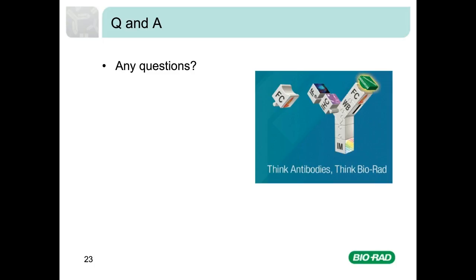I hope you find that compensation isn't as daunting as it first appears. Just have a go with your single staining and have a look at some of the no compensation panels on the website as well.